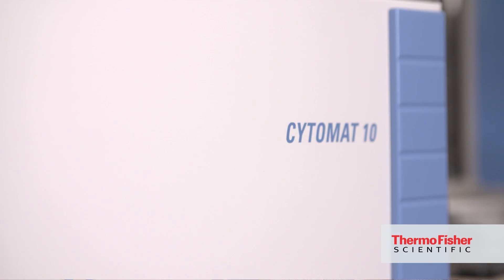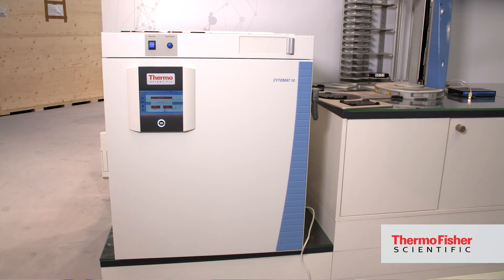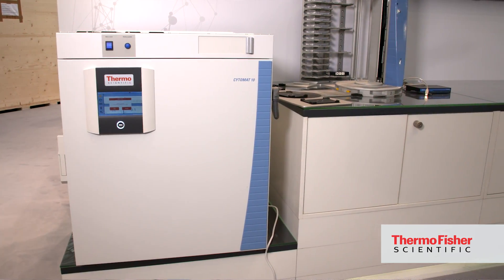I want to introduce today the new Thermo Fisher Cytomat 10C450 instrument. It is an incubator that works in the temperature range from 4 to 50 degrees Celsius. It is a brand new instrument with some very unique features.